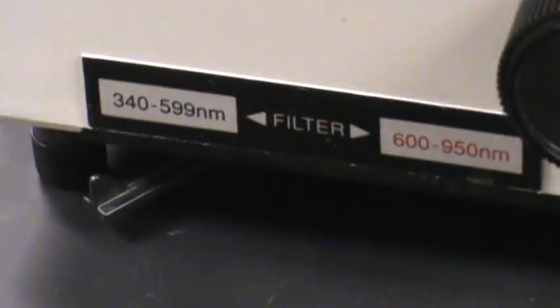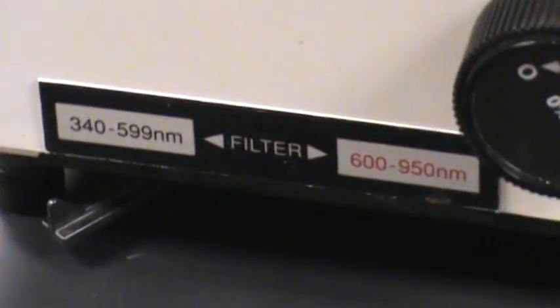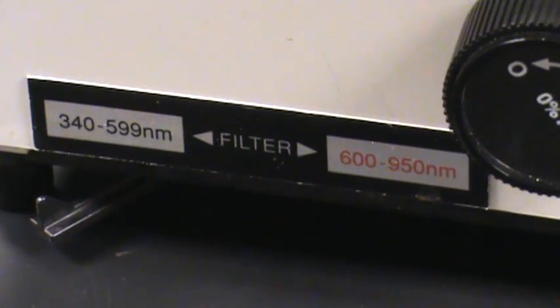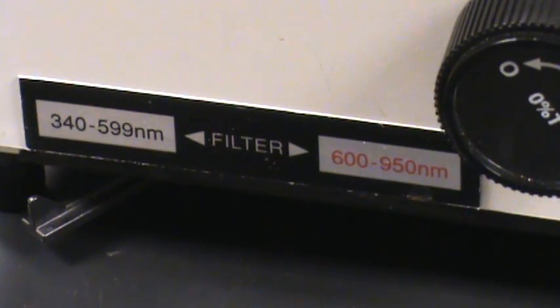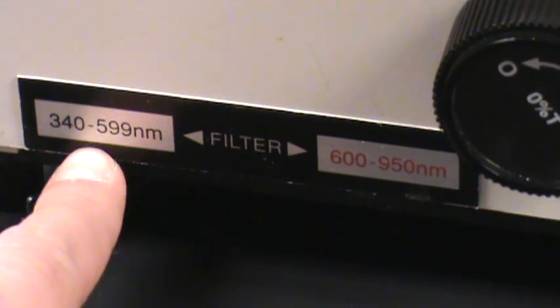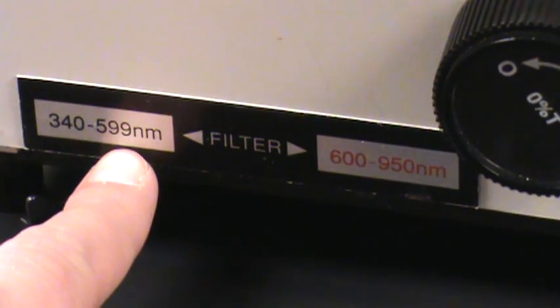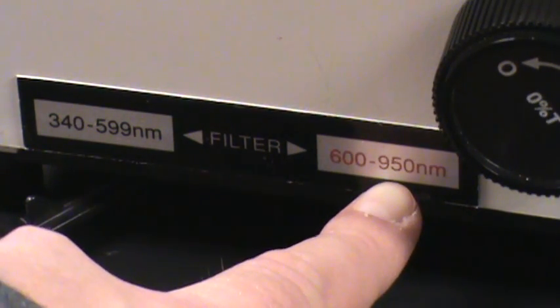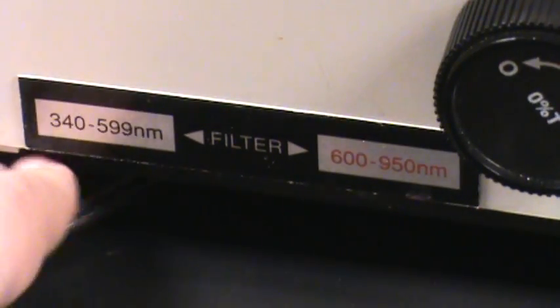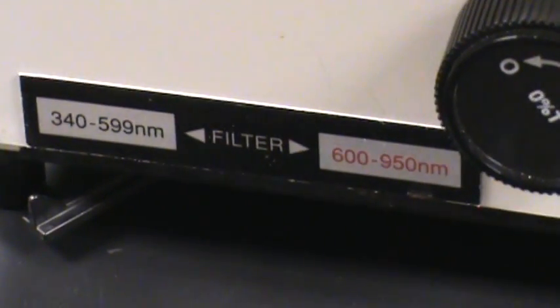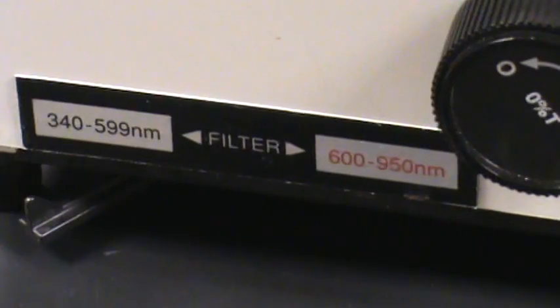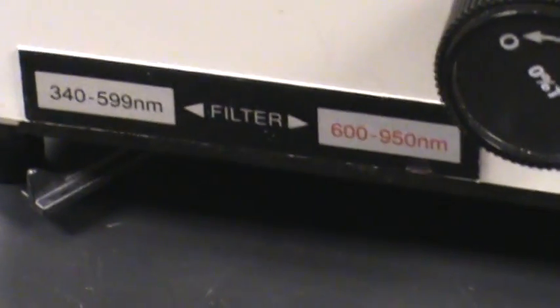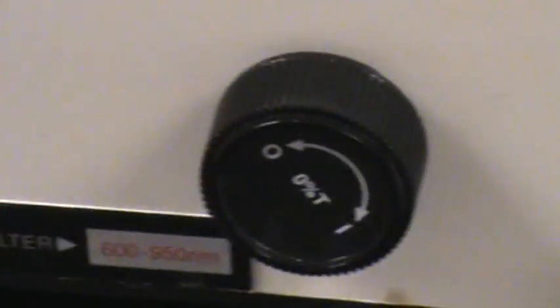We've also got a filter selector and that's going to become more important as we start doing our experiments because depending on whether we're measuring wavelengths in the 340 to 599 nanometer region or the 600 to 950 nanometer region we need this switch to be in different positions for the different filters. So for now we're going to start at the low end so I'll switch that to the 340 to 600 range.